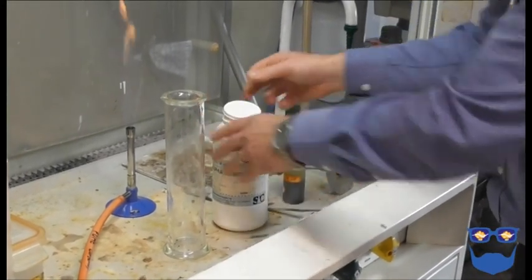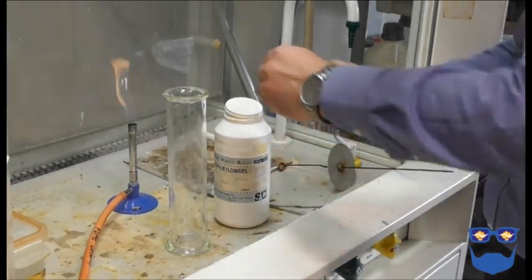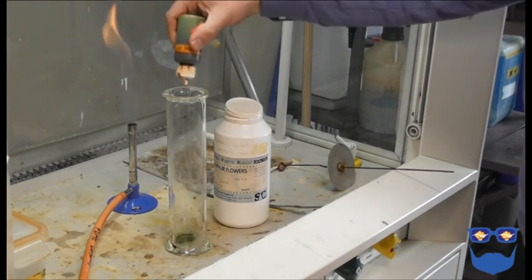Pour about three to five milliliters of universal indicator solution into the gas jar. You want the students to see the green color clearly.